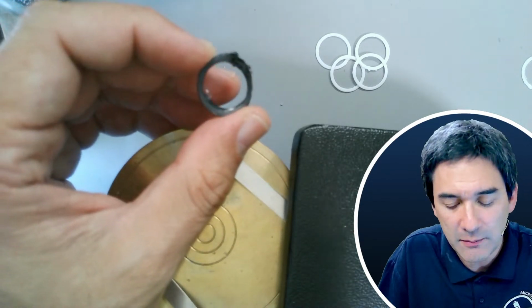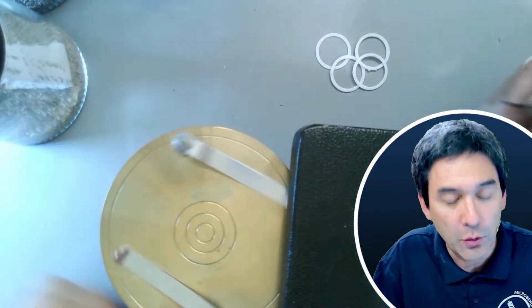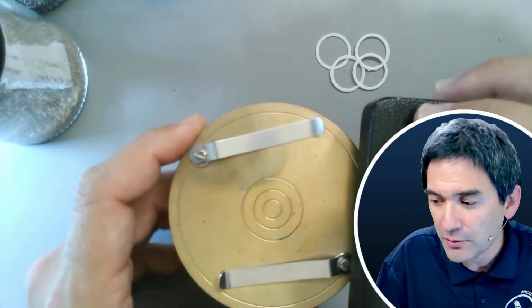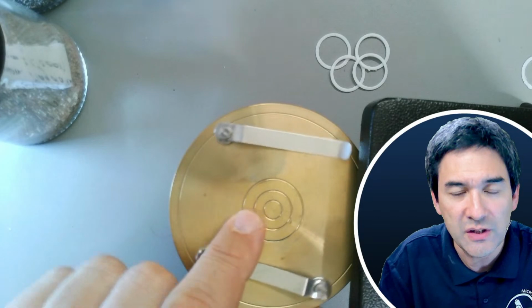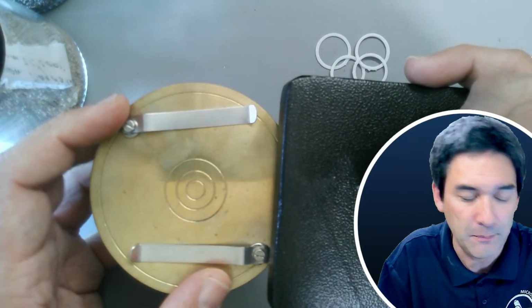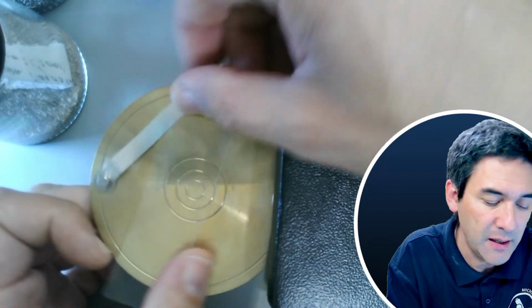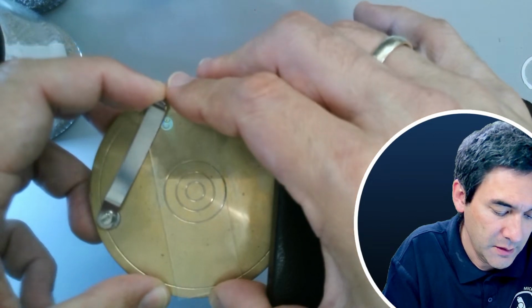Okay. So there's a question, what are you doing tonight? Today I'm trying to make slides with spacer rings to observe sand samples. Just for demonstration purposes, I'm going to use nail polish and the slide ringing table to make some spacer rings. But because it takes some time to dry, I'm just going to use the other one to show you.